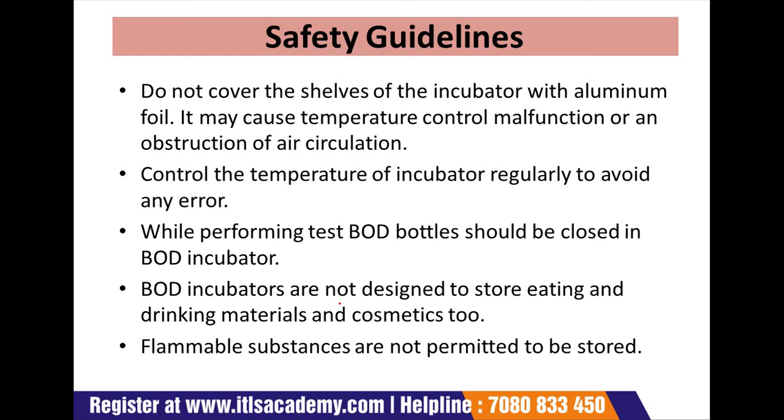Now we will discuss the safety guidelines. What type of safety guidelines we have to keep in mind when we are going to use the BOD. First one is, do not cover the shelves of the incubator with aluminum foil. It may cause temperature control malfunctions or an obstruction of air circulation.